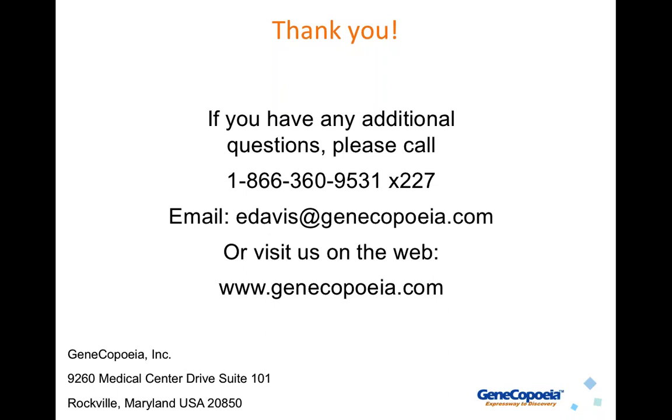Let's see. Can you isolate clones that joined via NHEJ? Yes, you can. It's not done with any kind of selection, though. You usually have to just isolate clones without selection, and then you screen those to make sure they have the NHEJ-mediated mutations. Okay, let's see. Next question.